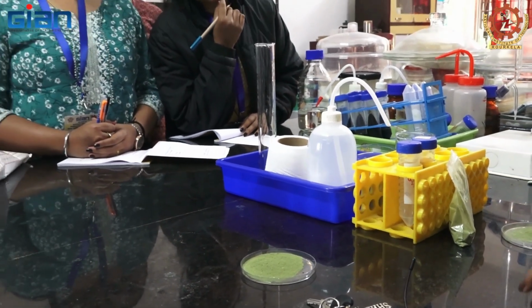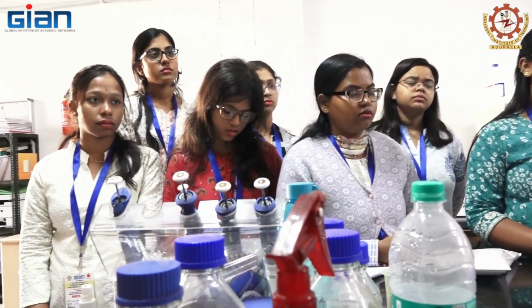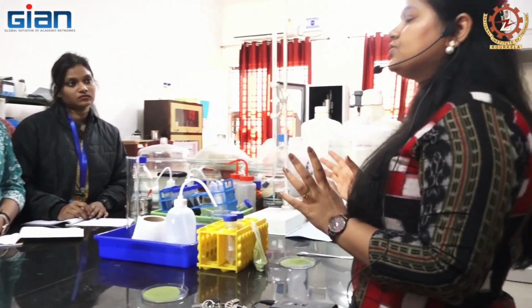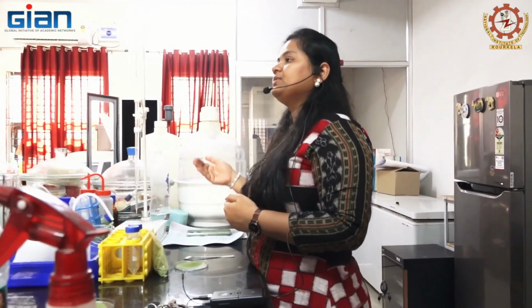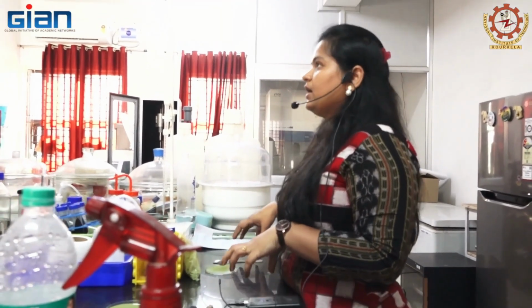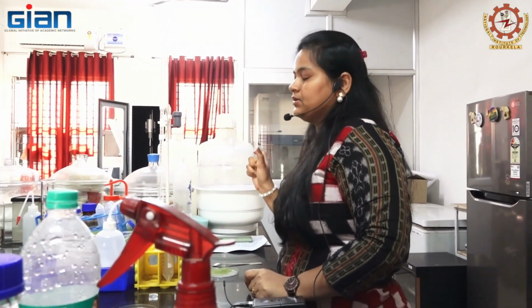The ultrasound assisted extraction involves ultrasound waves. What are ultrasound waves? It is the part of the sound wave which we cannot hear, because it is beyond human hearing. Human hearing is between 20 hertz and 20 kilohertz, but our ultrasound wave is above 20 kilohertz, so it cannot be audible to you. The mechanism of the extraction process is a term called acoustic cavitation.